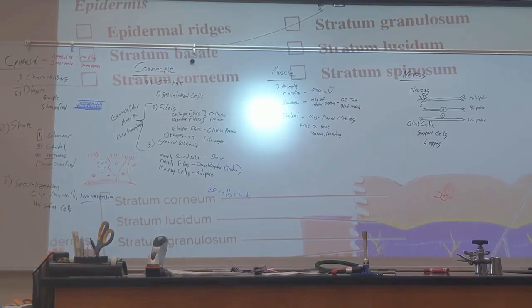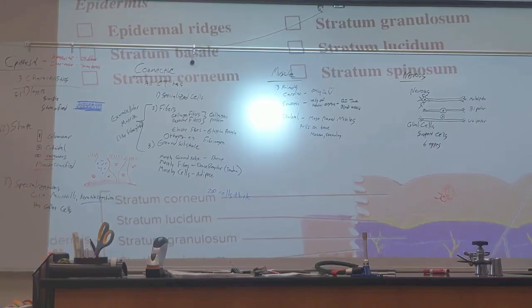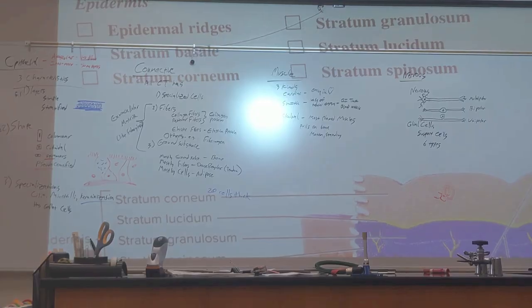All right, the next one, pseudostratified columnar. And I'll just tell you right now, with the cilia, this is going to be the lining of the trachea. Good? Pseudostratified columnar, that'll be trachea for the location. Function: goblet cells to make the mucus, cilia to move the mucus away, so you can swallow it down and kill the bacteria. Are we good? Are y'all with me?